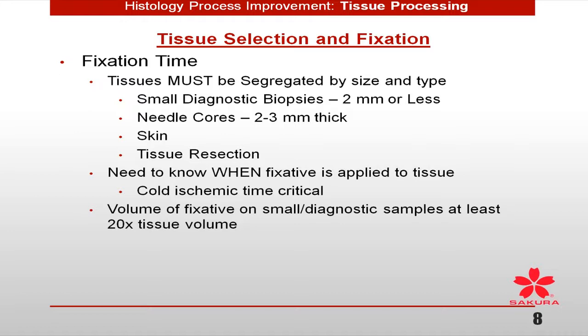If you're doing breast biopsy, you definitely have to follow all these rules. The way I've approached it is, if I'm going to have that kind of precision, information, requirement and documentation for this one piece of tissue, why wouldn't that be acceptable for all the tissues? Think about it. Something to think about. It's not easy to do, and it's not a regulatory requirement, but if you're being patient-centric and you want to give everybody the best process that you have, these are the types of things we need to move forward with in our histology labs.